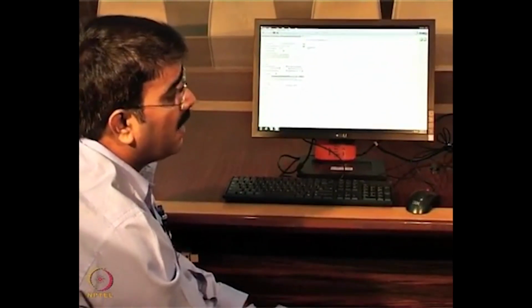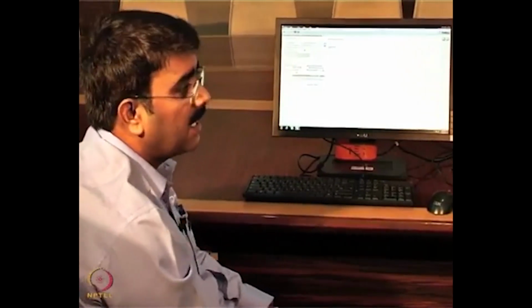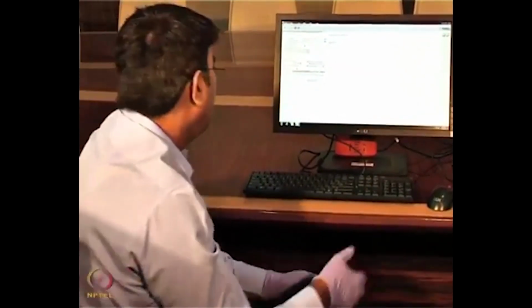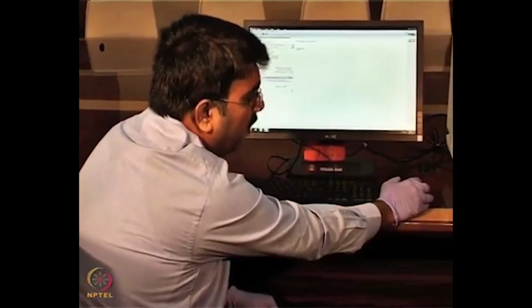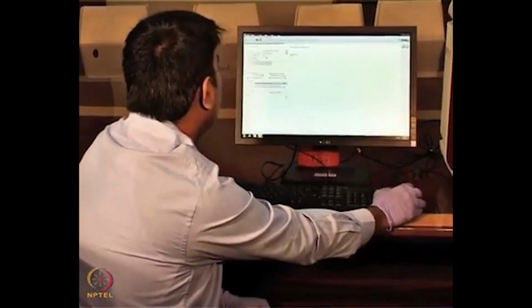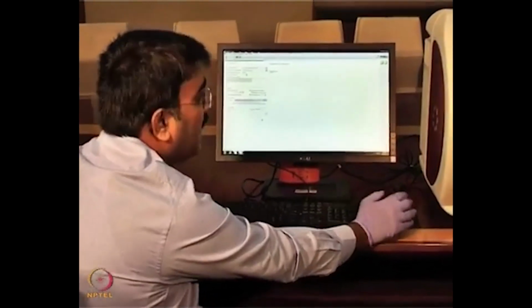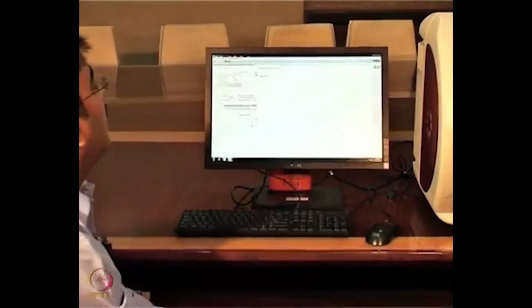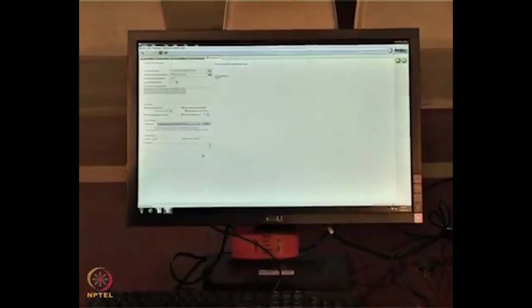In some cases it is required, some cases not. You know that shaking sometimes enhances the aggregation. So we can uncheck this, and also I think prior to the experiment we already started a hydration of the sensors. Now the sensors got hydrated, we can directly uncheck this and go for the experiment. And the sample plate temperature is at 30 degrees, so the plate is already stabilized. We can now go for the experiment.